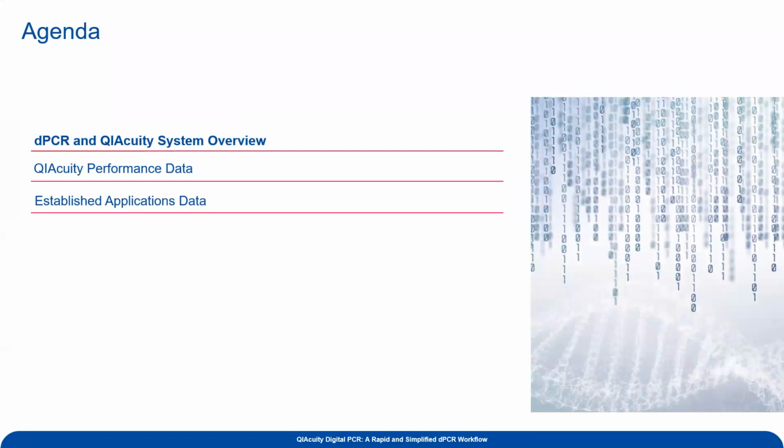So our agenda for today's talk is going to be talking about what is digital PCR, and then what is the QIAcuity system that you now have on site at Yanping's lab down here at ICBR, and basically how it operates, right? So there's some unique differences from this system relative to other digital PCR systems on the market, namely droplet digital PCR, which is sold by Bio-Rad, or the Stilla droplet PCR, which is Crystal Digital PCR, and also the Absolute Q as well, which is sold by Thermo Fisher.